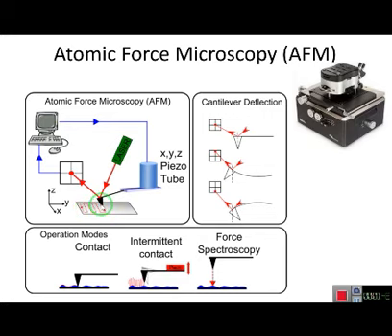Well, this cantilever is connected to the piezo, and if we want to see, for example, here we are going up, here we are going down, and how we are moving on the outer shell of our sample, we can emit light later on the top region of our cantilever and check the variation of the emitted light here.